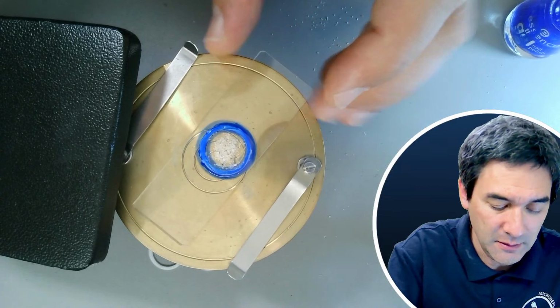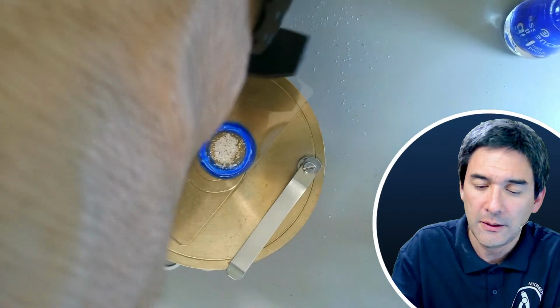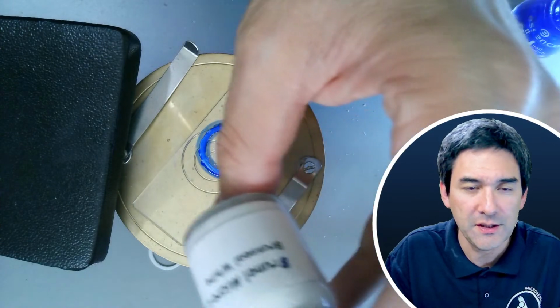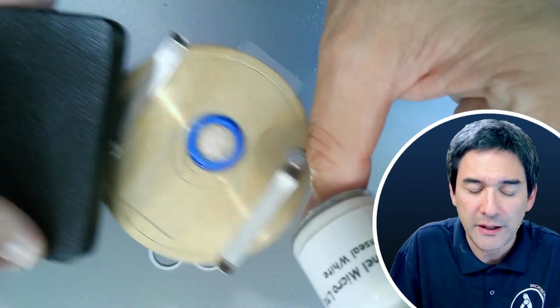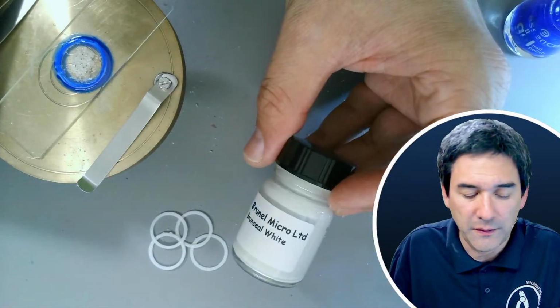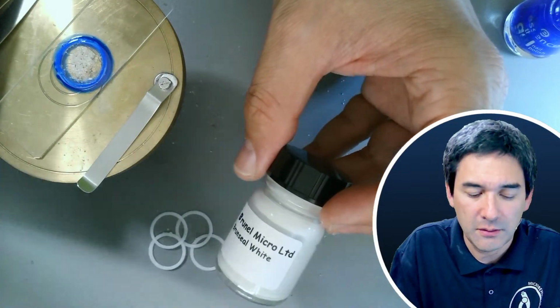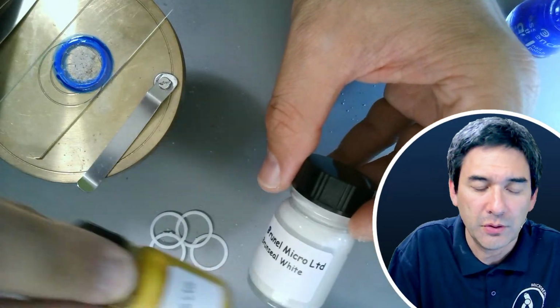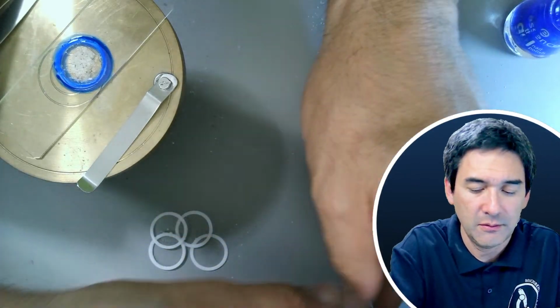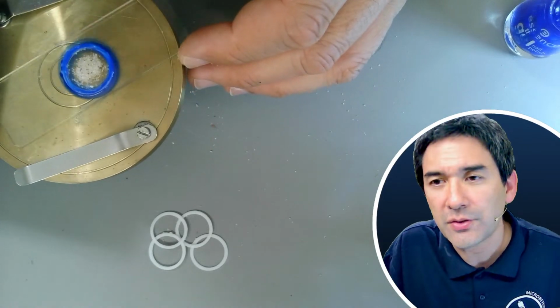When I bought this slide ringing table, it came along with a couple of paints here. I just want to show them to you. I bought this from a company called Brunel Microscopes in the United Kingdom, and it came along with different paints that can be used. But I'm just using nail polish because that's what I'm used to. So this is also a possibility here. Now let's have a look under the microscope.